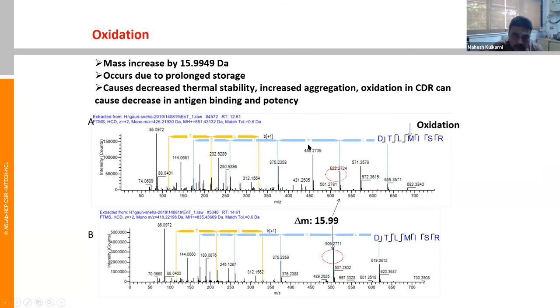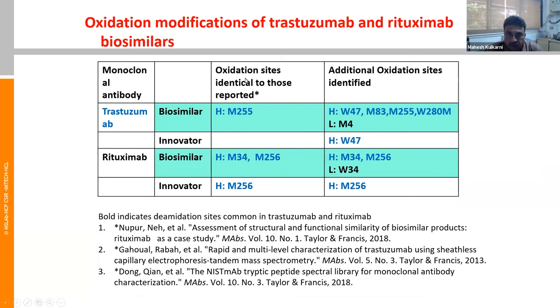Likewise, we have identified oxidation sites and compared them to the previous study, as well as identified new oxidation sites in both trastuzumab and rituximab, biosimilar as well as innovator.